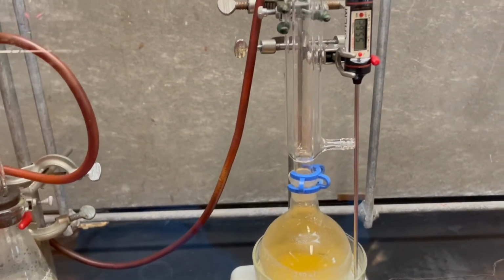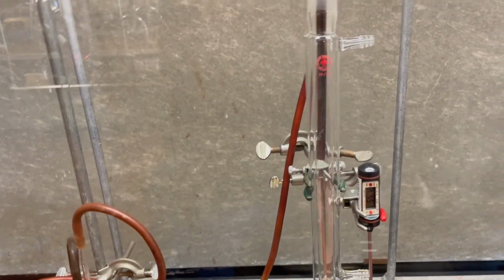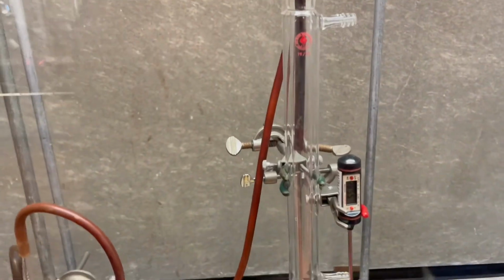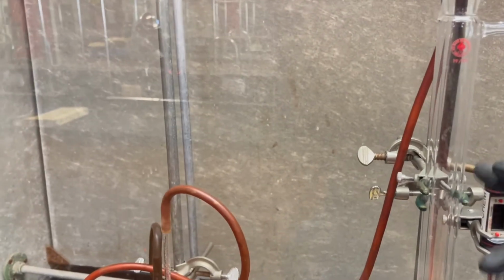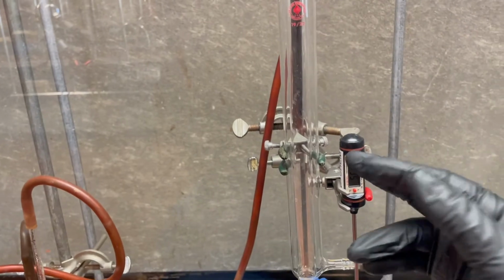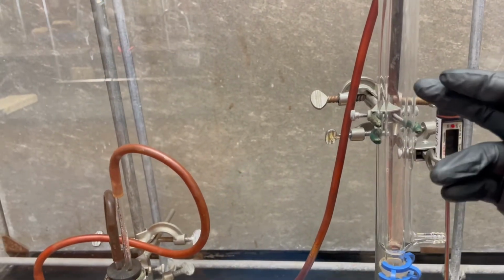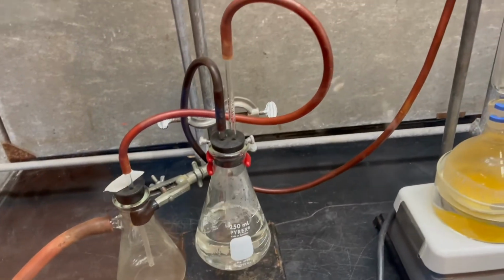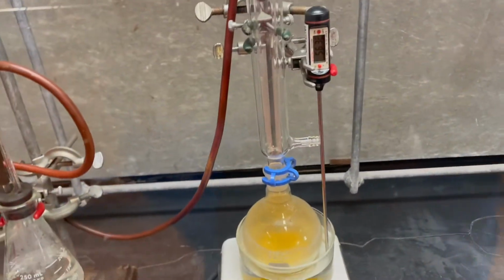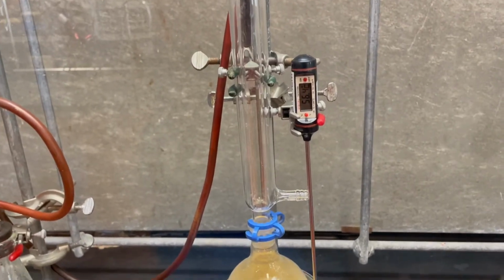What's going to happen is as that rises up, we've got this hose, it's about halfway down, a little less than halfway. What I wanted to mention is that when we see this gas coming up, if it gets past this point, then that means that thing's not doing its job, and we need to make sure that it's bubbling and everything is doing its job the way it's supposed to. But for now, we're still waiting.